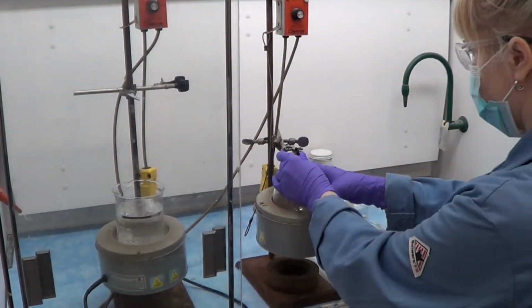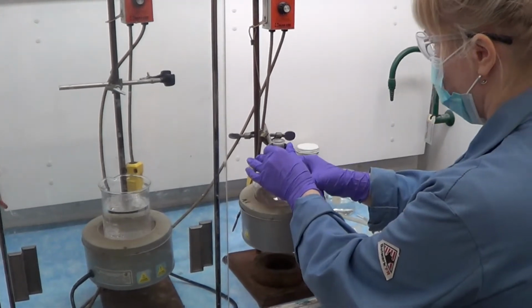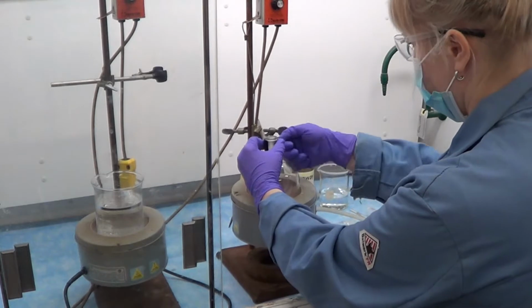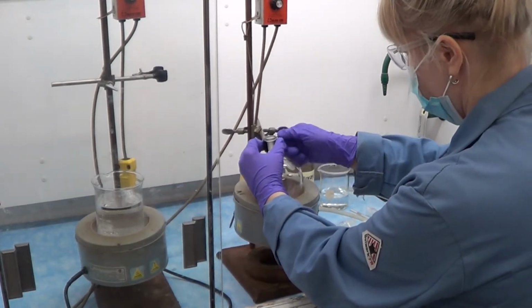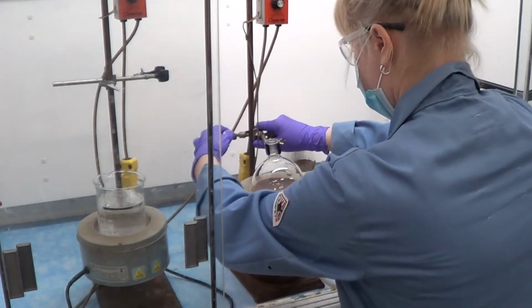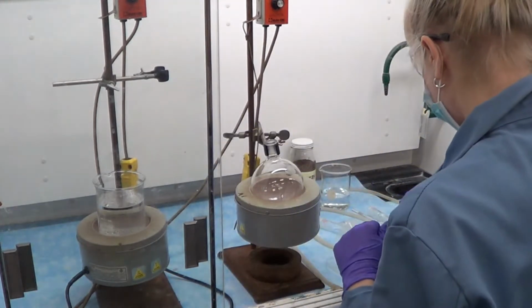The goal of this experiment is to isolate an enantiomer of carvone and compare it with the other enantiomer. In this lab, we will be isolating the S enantiomer. You will be comparing the properties of each, such as the polarity via TLC, Baeyer test, IR, and smell.